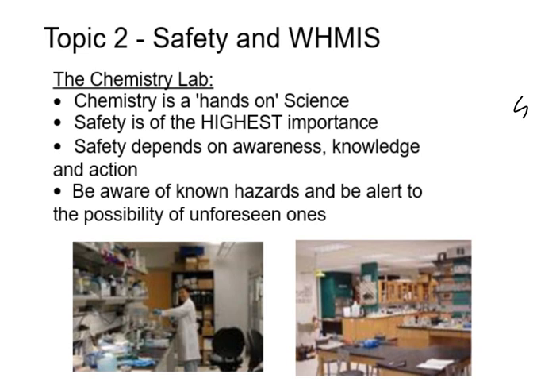Today we're going to talk about safety and WHMIS symbols. And you guys will eventually write your PAT. You guys have heard about this a little bit, right? Grade 9s, we write PATs. There is always, always, always a question on WHMIS symbols. So it's one of these things where I need to just show you what they are, and you just need to memorize the WHMIS symbols and the different categories of safety.